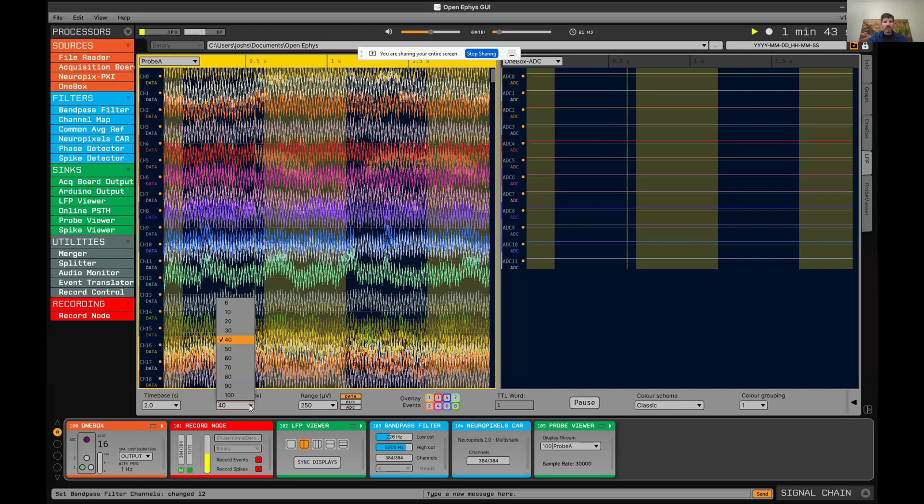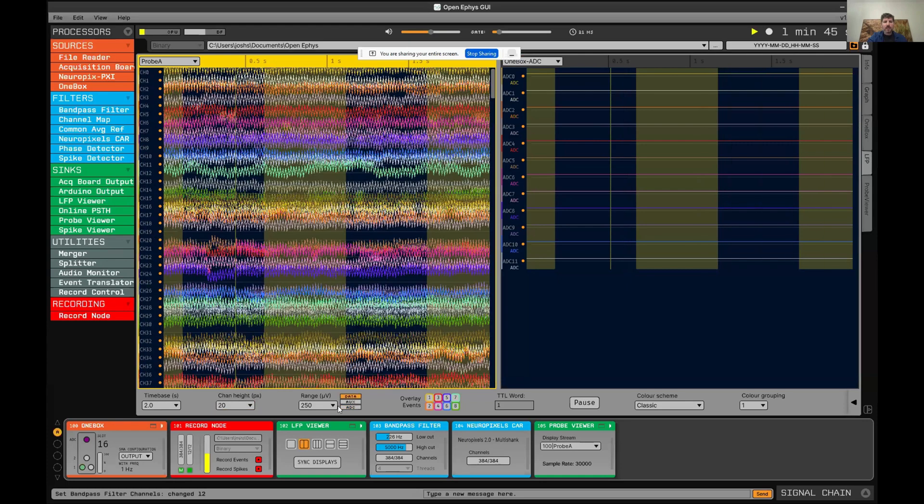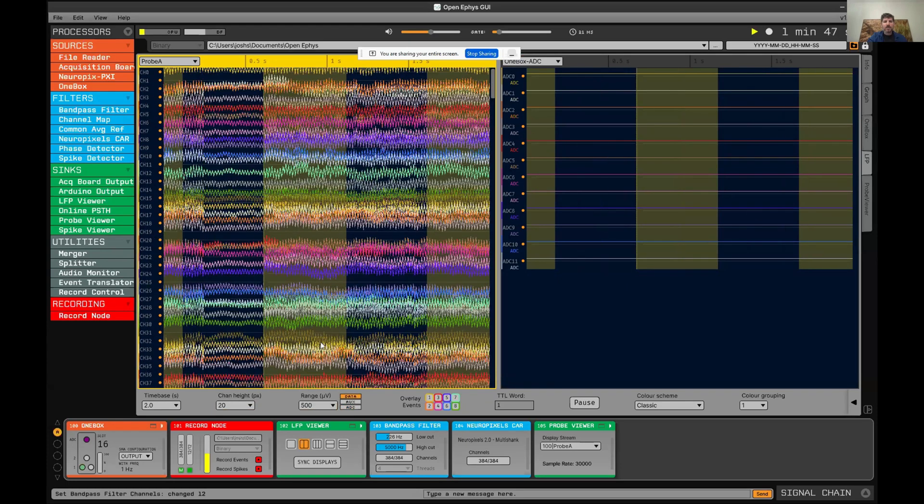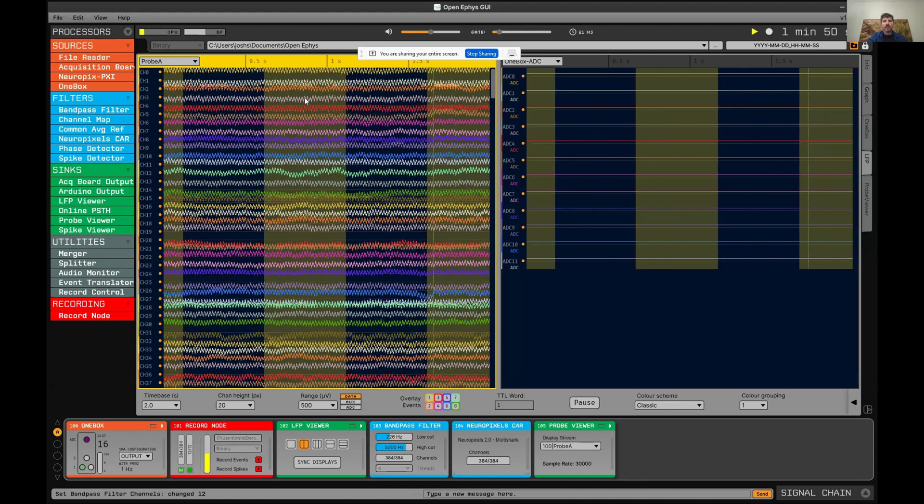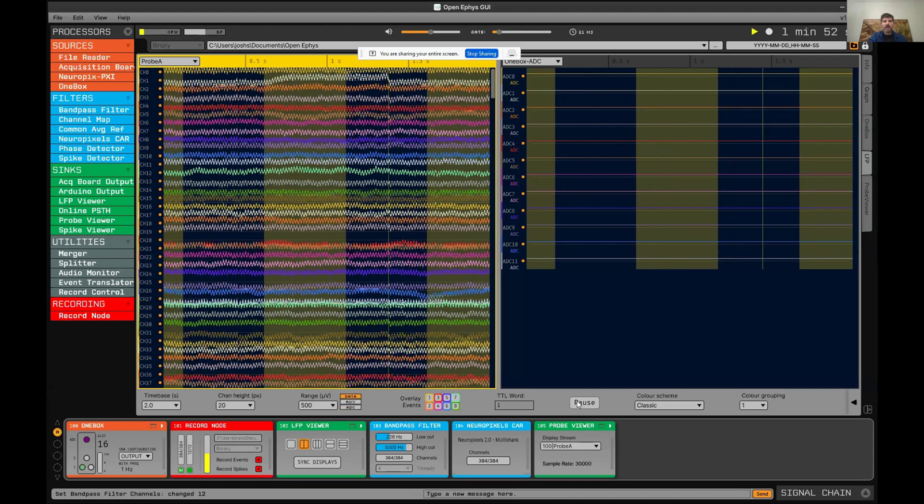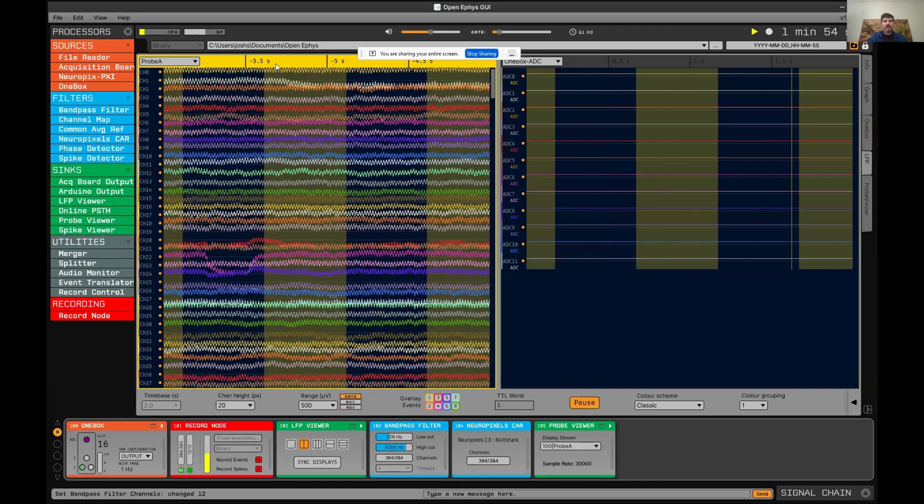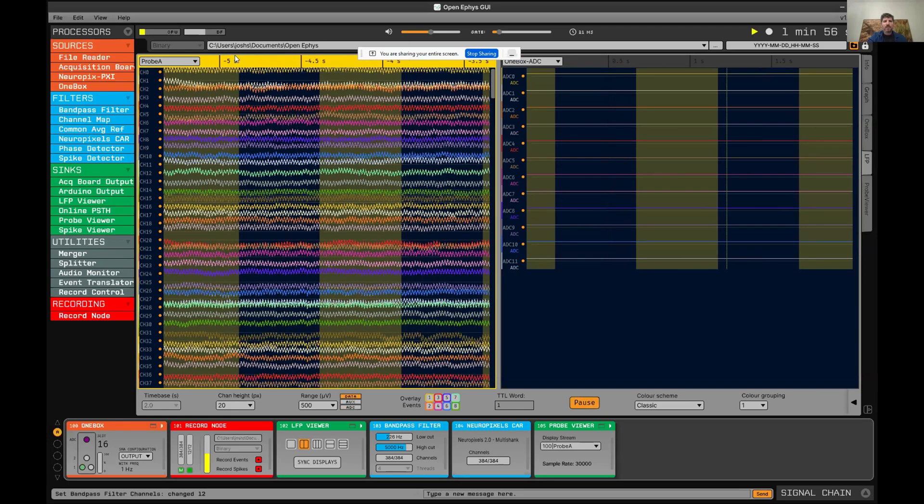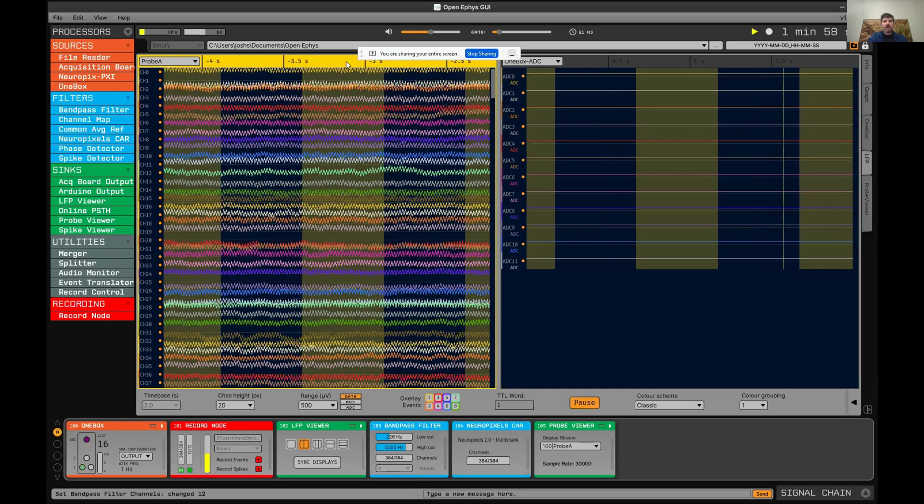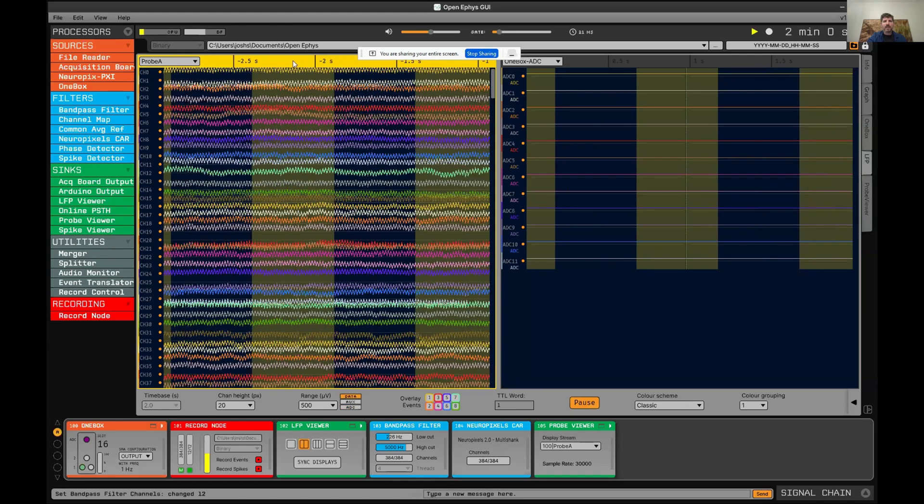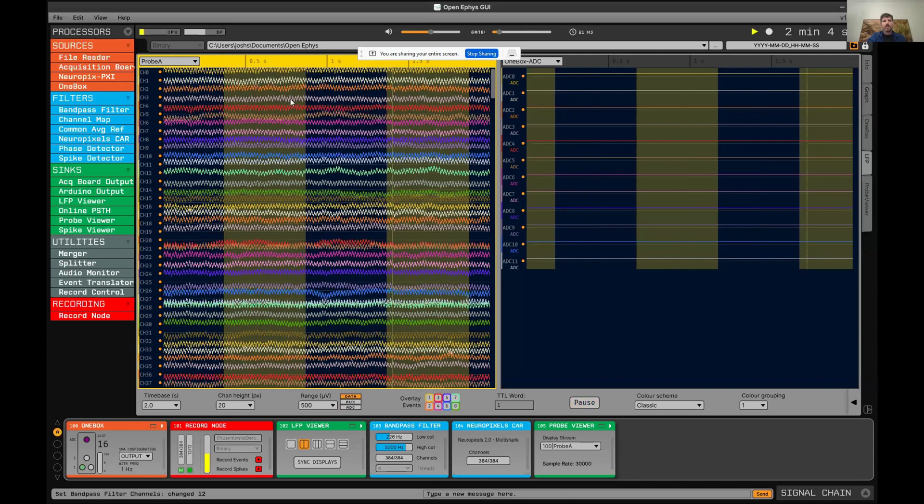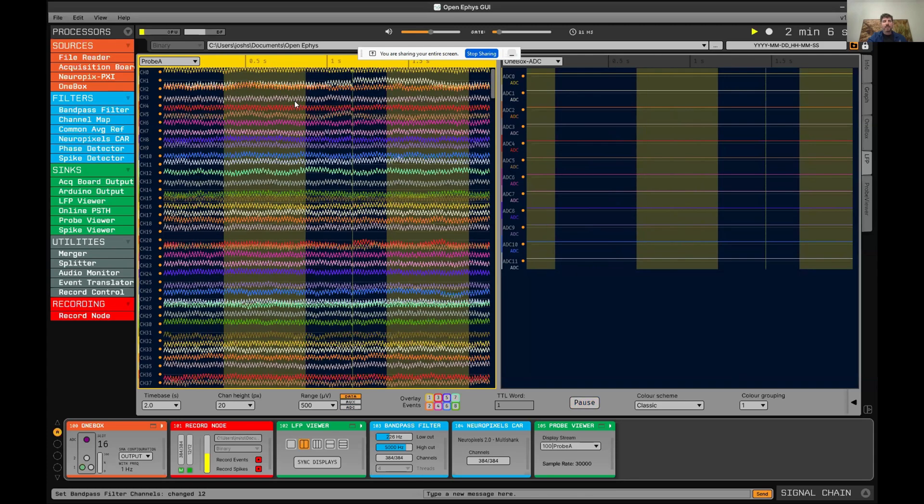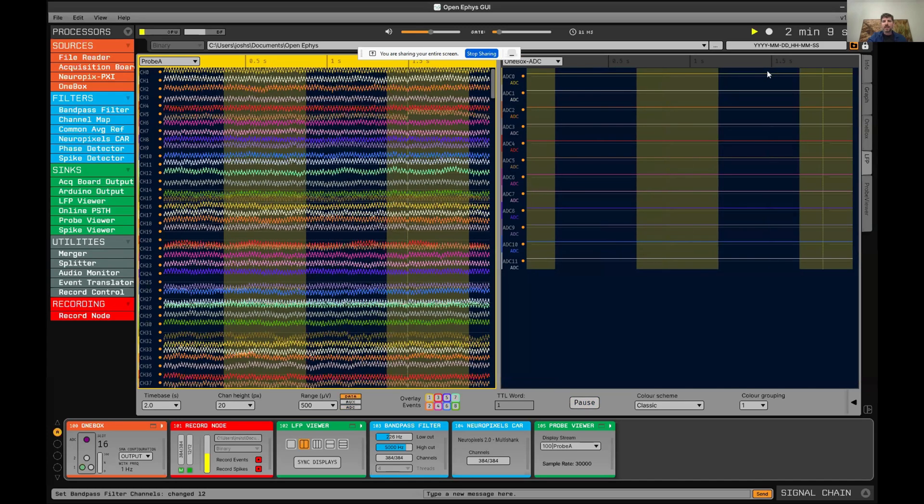Here we can change the channel height, change the voltage range. Another super useful thing about the LFP viewer is if you pause the display, you can scroll backwards in time. You can see what happened previously in your data without actually pausing acquisition. You can double click on it and it will restart again. That's useful in case you missed something.